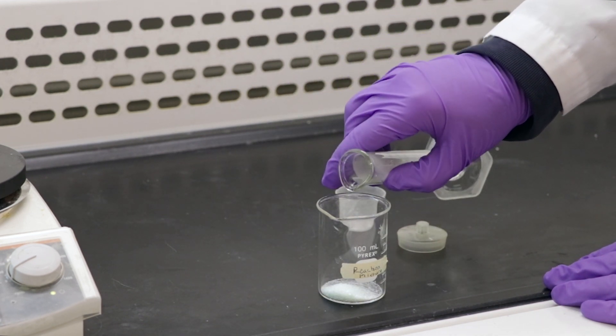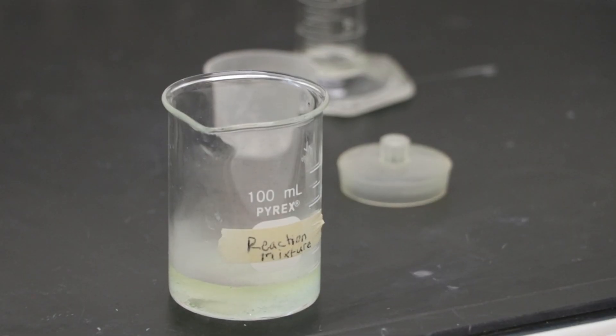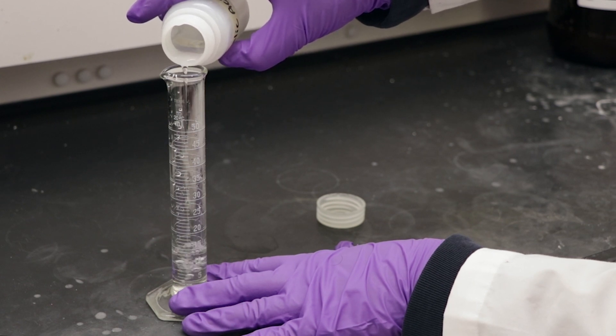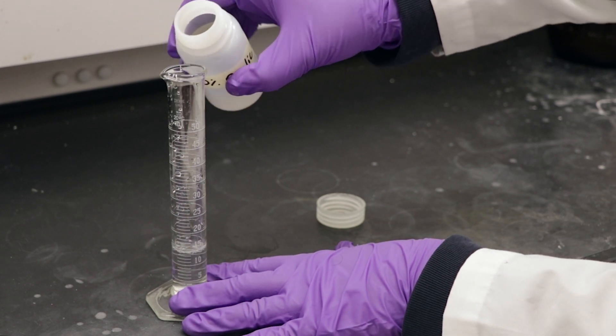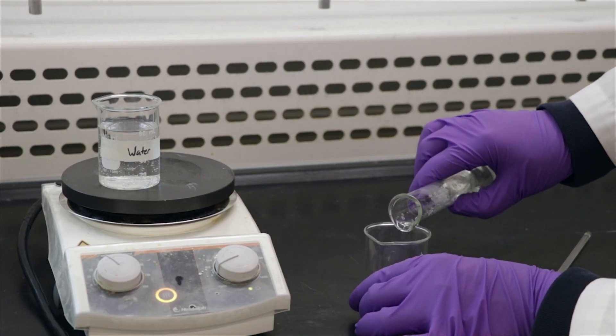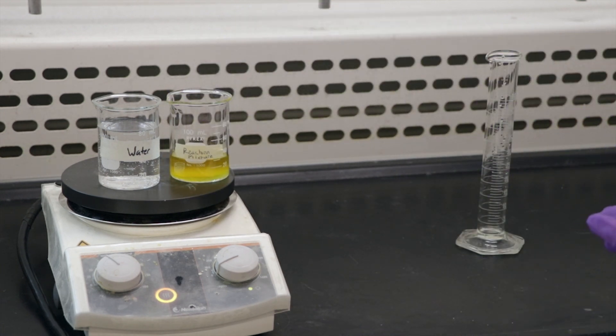If the solid doesn't dissolve, stir the solution. Go to the TA fume hood and measure out 15 ml of oxalic acid. Cover the solution and take it back to your fume hood. Gently add the oxalic acid to your reaction mixture. Place it on the hot plate and stir the solution.